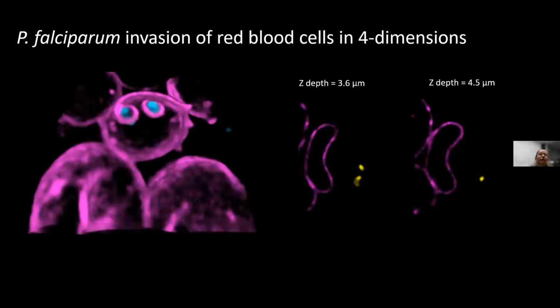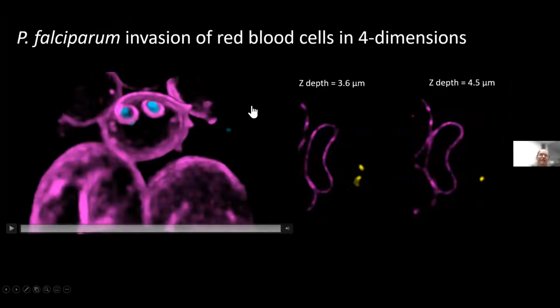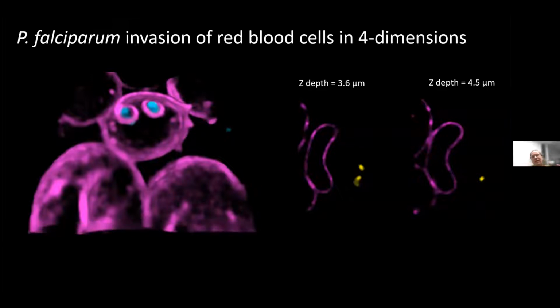fixed data, the electron microscopy data that gave fantastic resolution, and also the other fixed cell experiments that were being undertaken. And as far as the DIC time-lapse experiments, they were able to get really great detail of those early stages of invasion, the pre-invasion stages where the parasite interacts with the membrane. But once the parasite started to be internalized, it really wasn't possible to see, did the parasite actually go in and stay in there? How did the membrane seal up behind it? Those kind of details just weren't visible.